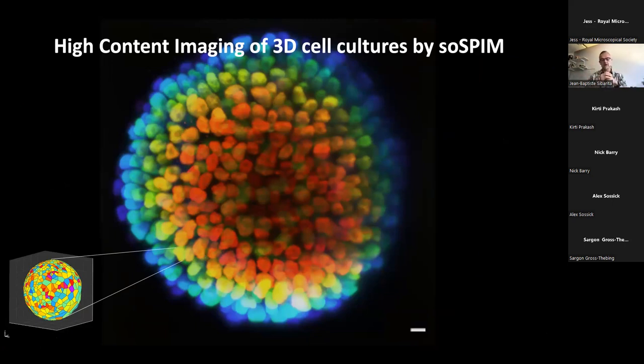But you will see that technology-wise, this is very nice, okay, we change completely the dimensions, by an order of magnitude very easily, but you can see this strong analogy between these two images, which I really like. Even though we were looking at a single cell before, now you can see that the tool can be very quickly very similar, not looking at clusters, but looking at the organization of cells in 3D. And this is usually the kind of readout you want from this technology to understand, for example, how a drug will affect the morphology of a 3D culture or an organoid.